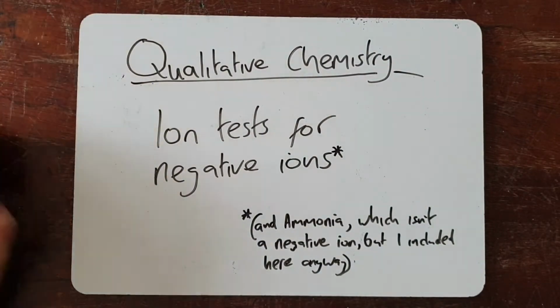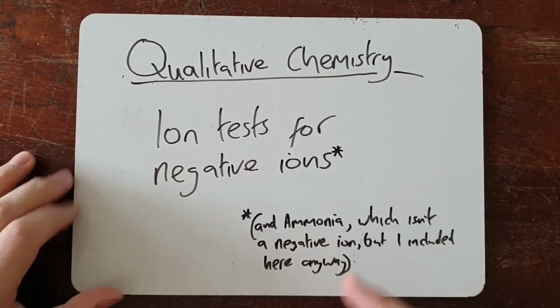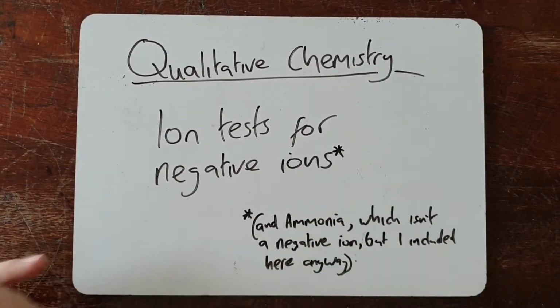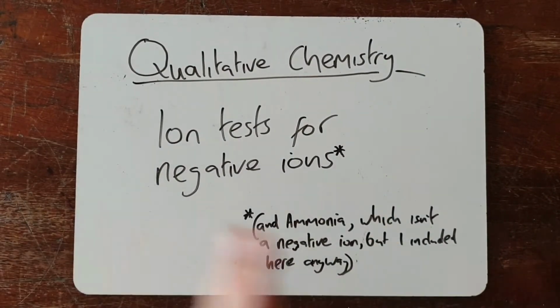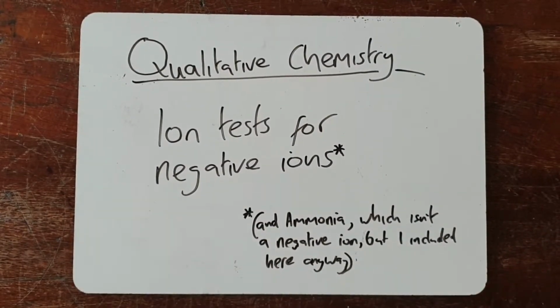Also in the video today is a test for ammonia. Ammonia isn't technically a negative ion, but to make the split of the video nicer between the negative ones and the positive ones, I've included ammonia here.